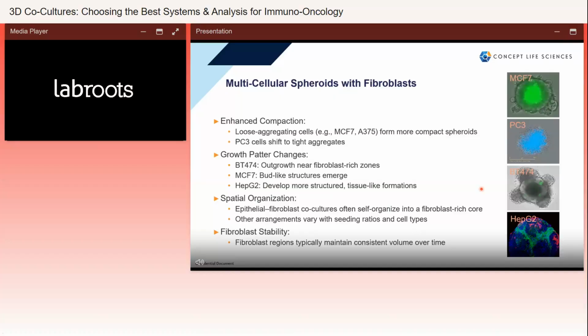And by incorporating cells rather than just incorporating ECM, we can control the number of those cells that go in, so we can go down to physiological levels. In the case of the HepG2s here, we've got essentially one fibroblast for every 19 cancer cells, which is roughly where the liver sits. In liver, you have about one stellate to every 19 parenchyma cells. Or you can go the other way: incorporate lots of fibroblasts and have very few cancer cells, essentially mimicking that really fibrotic environment.